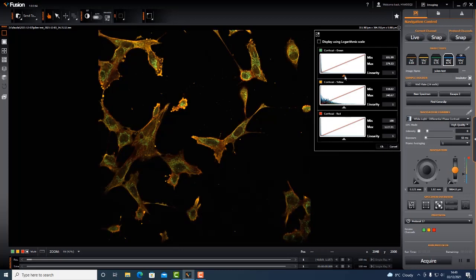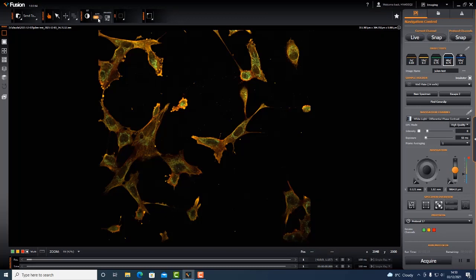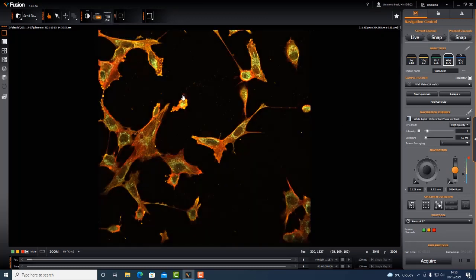And then also I have gamma here, so I can play with gamma as well if I so wish to change my intensity. It's just that you can display your sample better, more clearly, if you need to. I can also just manually put numbers in here as well. Okay, but if I want to go back and restore where I was, then I can just click Auto Map and it'll restore to its existing position.